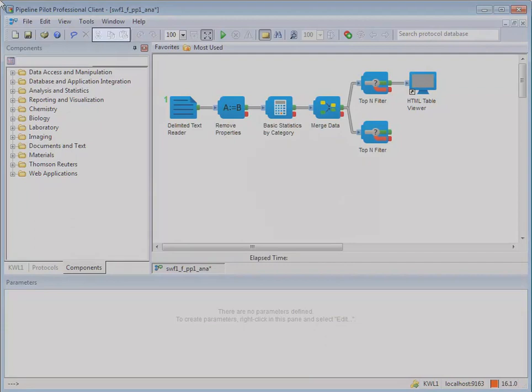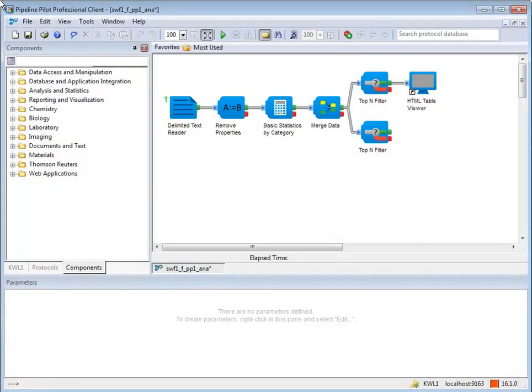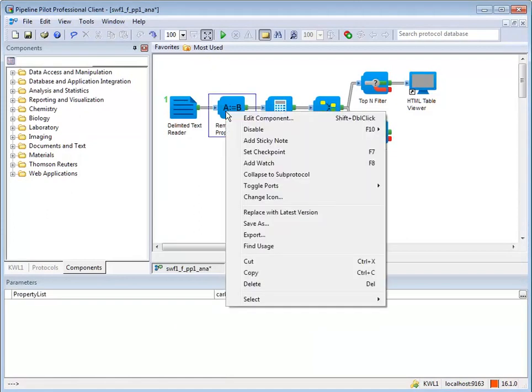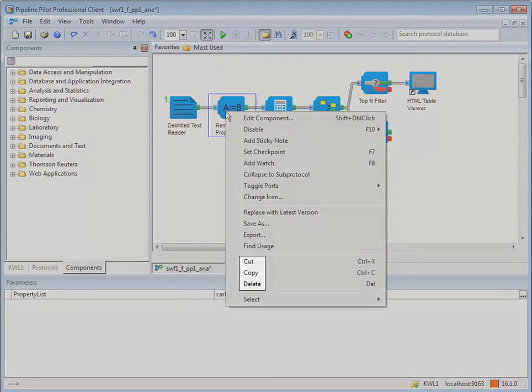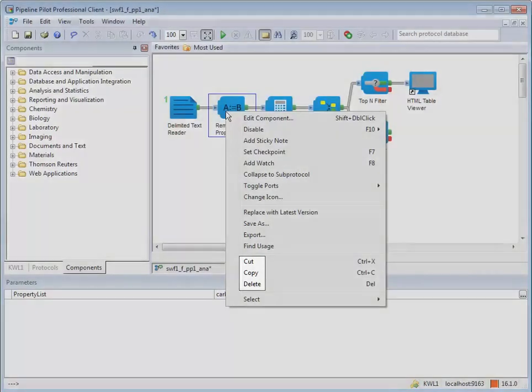There are buttons on the standard toolbar for these functions as well. You can also right-click on a component and select an option from the component menu that appears.